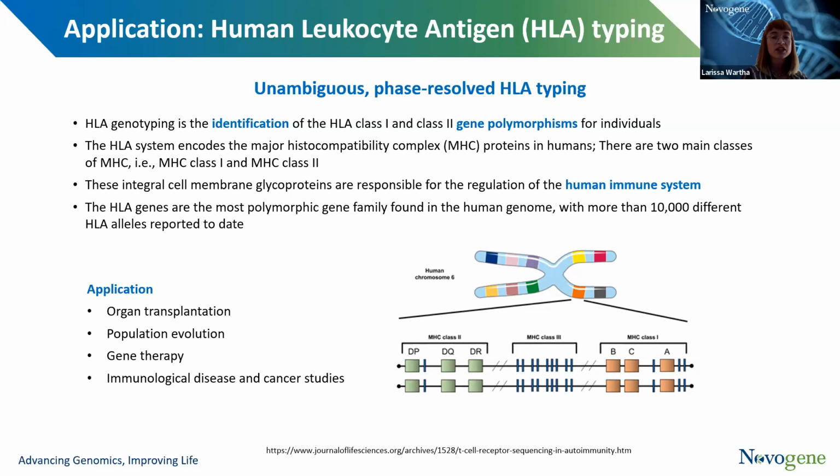And the development of NGS has completely changed the landscape of genotyping compared to traditional HLA genotyping and Sanger sequencing, because it enables robust, simple, high quality, and high throughput analysis of the key HLA genes, and the data can be phased to a minimum of 6 digits. And here we can use either WES, WGS, or even direct capture approaches.